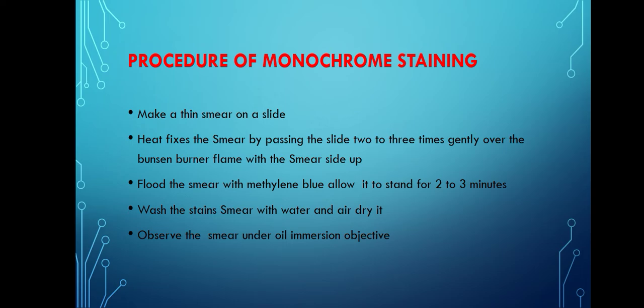Flood the smear with methylene blue. Allow it to stand for 2 to 3 minutes. Then wash the stained smear with water and air dry it. Then we have to observe this smear under the oil immersion objective.